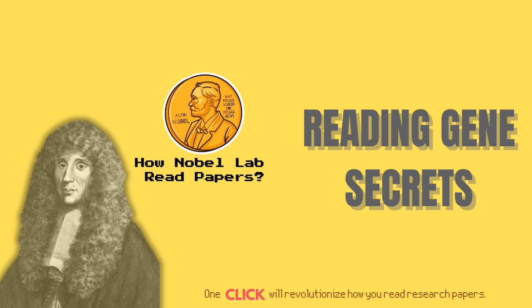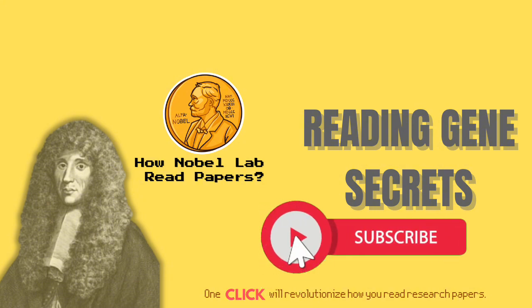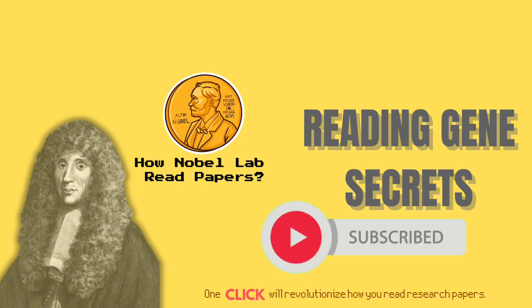The paper's Figure 1 kind of lays out the workflow. Can you walk us through that, starting with the biological stuff? Sure. So you start with your RNA sample. Typically, they use poly-A selected RNA that targets the messenger RNAs mostly, the ones carrying protein codes. And you isolate it from your tissue. They used mouse brain, liver, skeletal muscle. Good complex tissues.